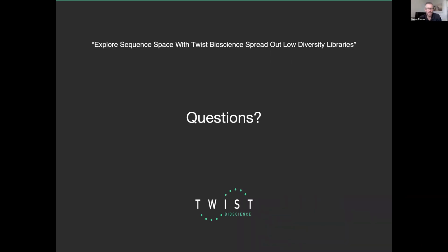Regarding the conversation we're just having on the universal tails, if the tails are present, does it count against the 1 KB? No, it doesn't. Great.